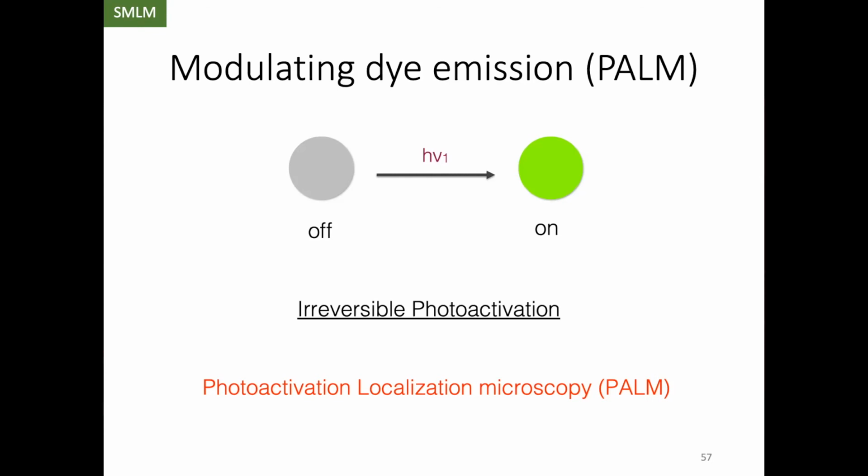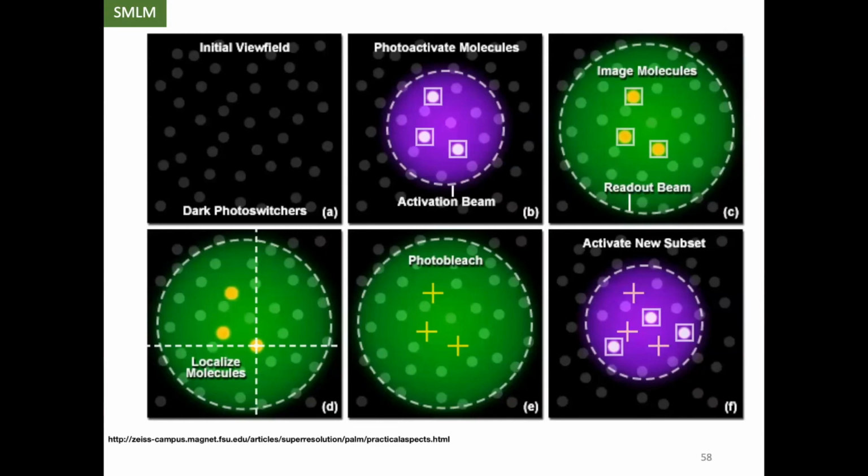So photobleaching causes the intensity of the dye to decrease versus time, right? So if you have intensity, so in a photobleaching process, you have an exponential decay of the fluorescence intensity over time. Okay, so let's see what that looks like.